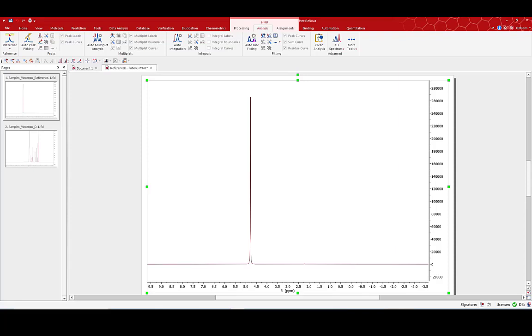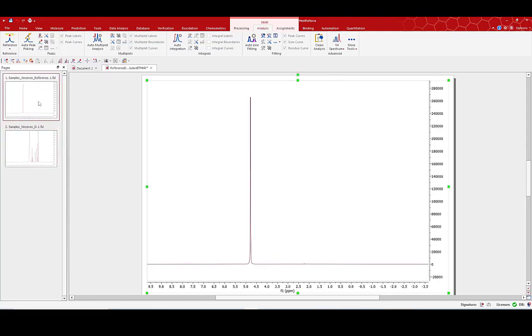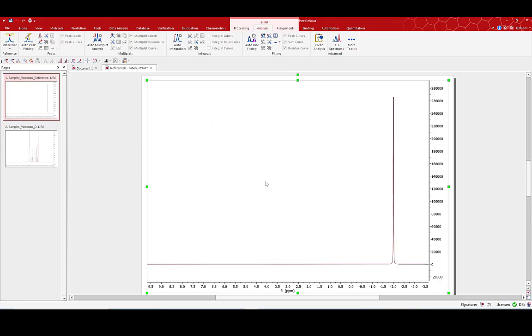Let's see how we can do this in MNOVA. I have two spectra: a reference spectrum and my spectrum of interest. The first thing I need to do is move the reference peak out of range of my peaks of interest, and I'll do this using the referencing option. I'll simply select my peak and set it to minus 2 ppm, way out of range.